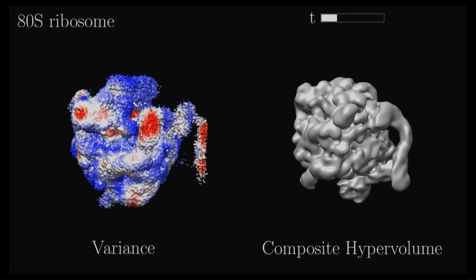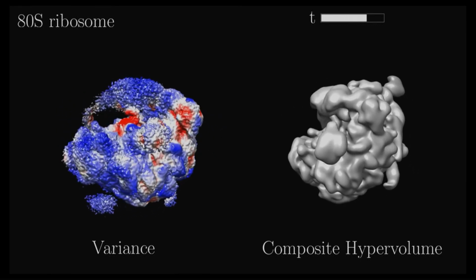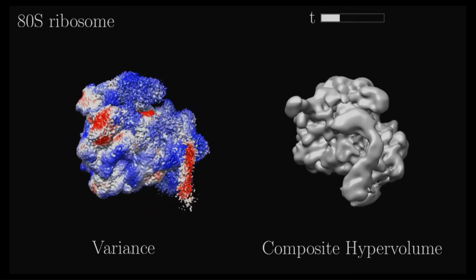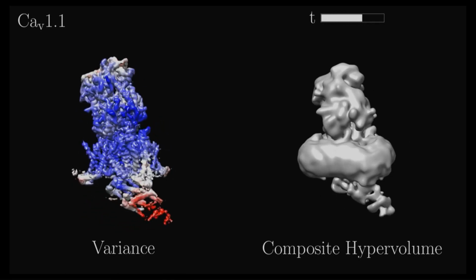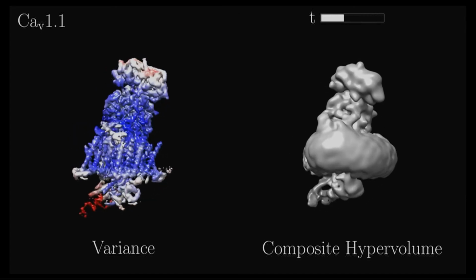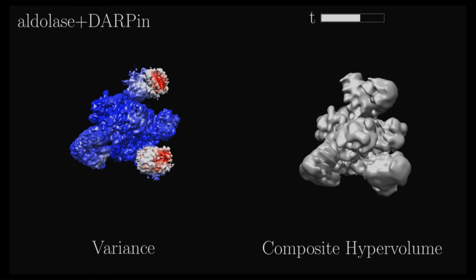I think the next molecule is my favorite one in terms of the continuous heterogeneity, so I'll show you that one as well. This is in collaboration with Ninian at Princeton. You can even see the helices. It's a very nice set of data. Maybe I'll show you one more, because what you see here, the fat region, is just because it's sitting in the membrane. So that's what we're recovering.